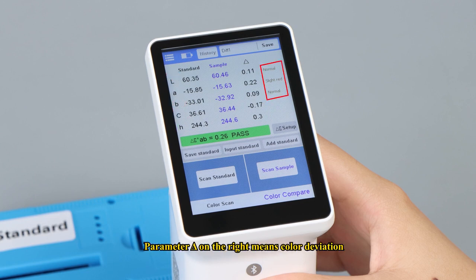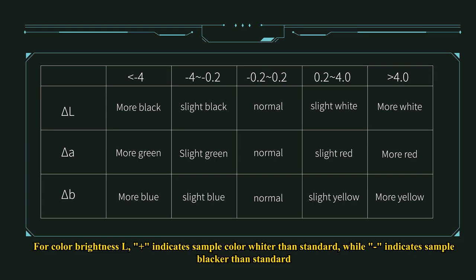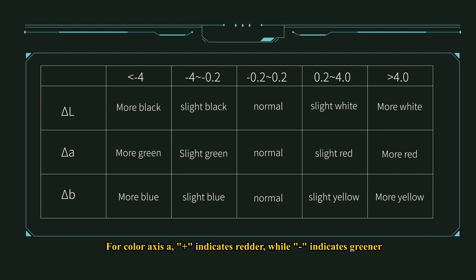The parameter delta on the right means color deviation. For color brightness L, plus indicates the sample color is whiter than the standard, while minus indicates it is blacker. For color axis A, plus indicates redder and minus indicates greener. For color axis B, plus indicates yellower and minus means bluer.